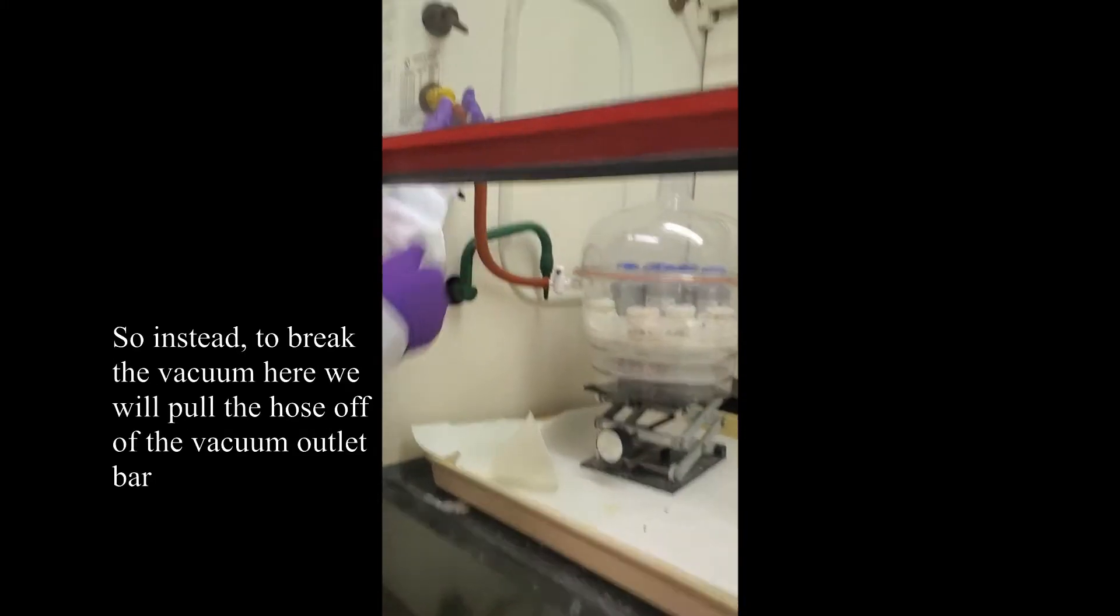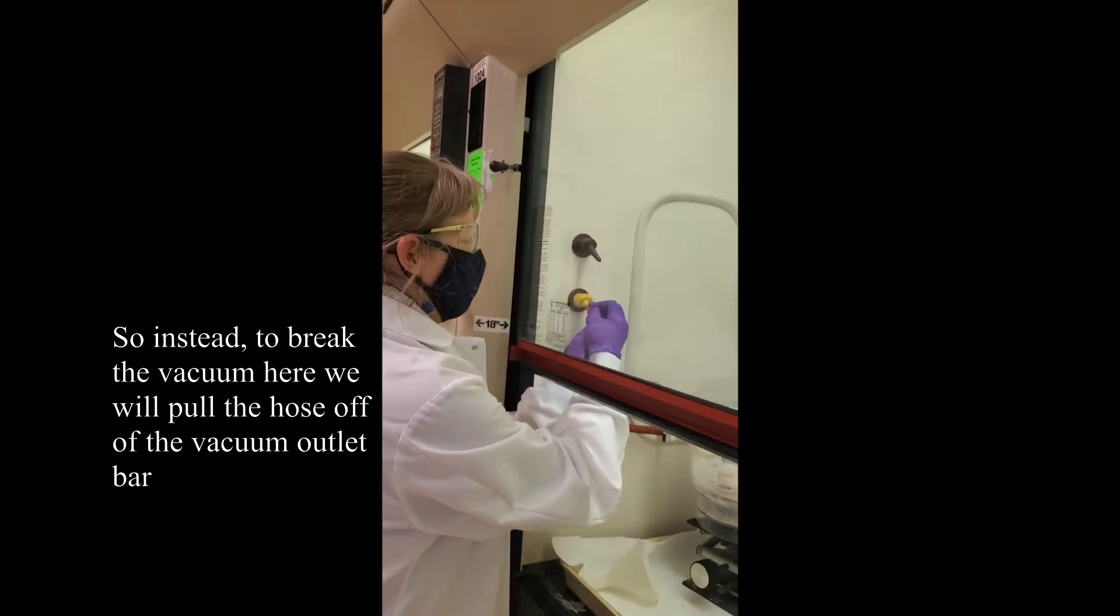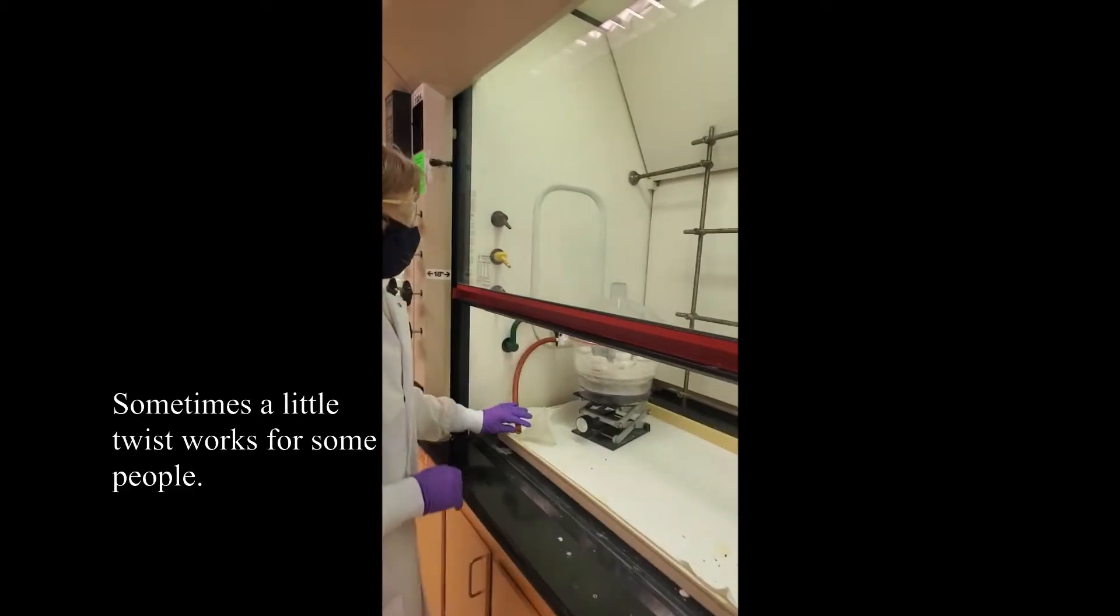So instead, to break the vacuum here, we will pull the hose off of the vacuum outlet valve. Sometimes a little twist works for some people.